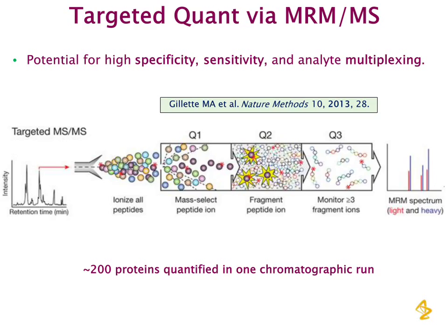Recently, high resolution, high mass accuracy MS systems, once confined to data-dependent discovery work, are increasingly being used for targeted MS analysis with benefits of higher specificity and lower potential for false positive quantifications. This type of instrument is very interesting but will not be covered here.